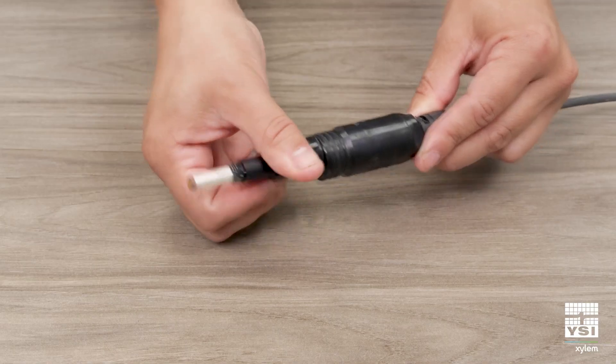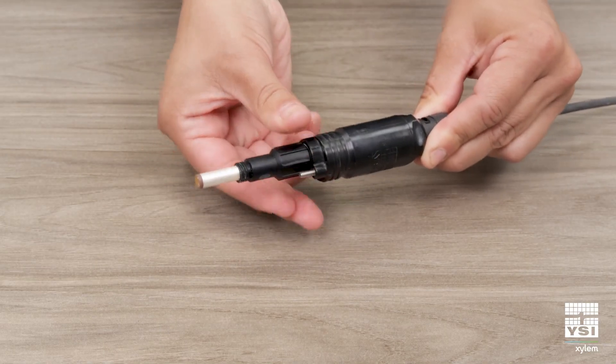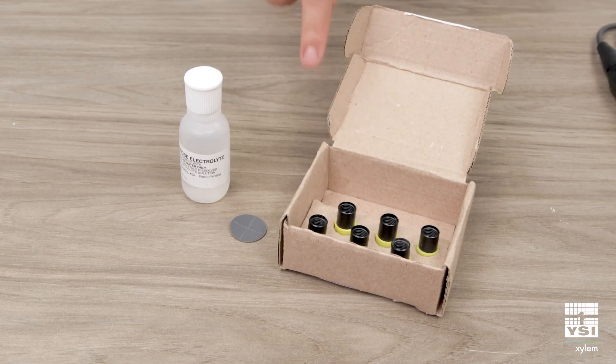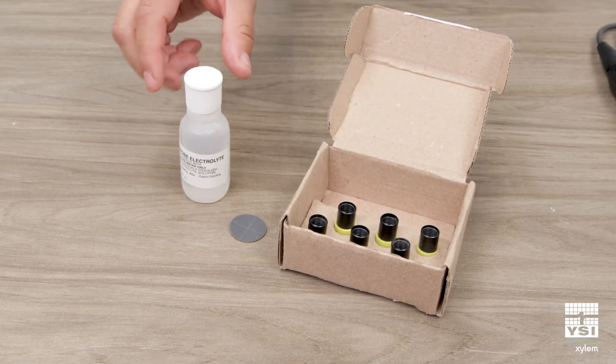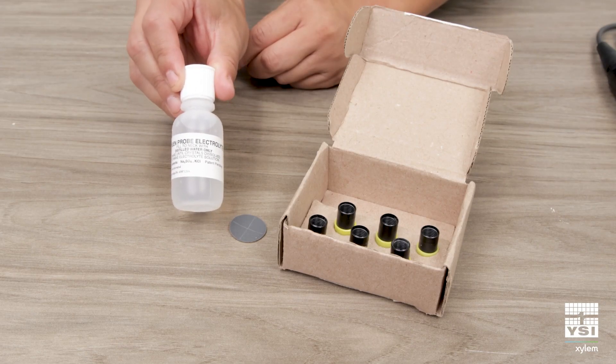I'll install my DO sensor first. In each membrane kit, you'll see there are six replacement membrane caps and an electrolyte bottle that you'll want to fill to the neck with deionized water to make your electrolyte solution.